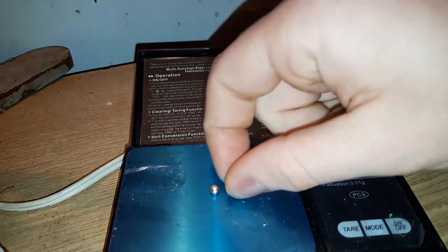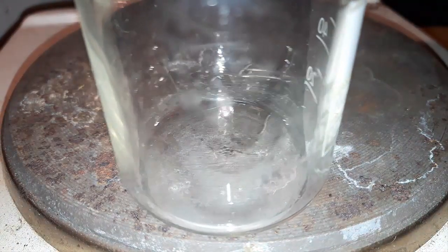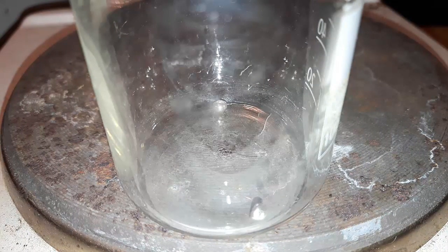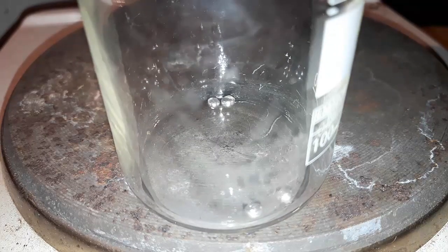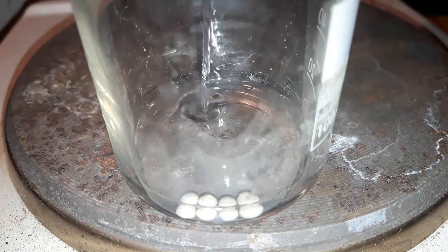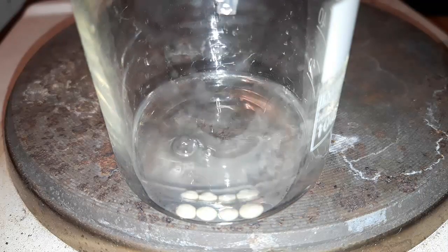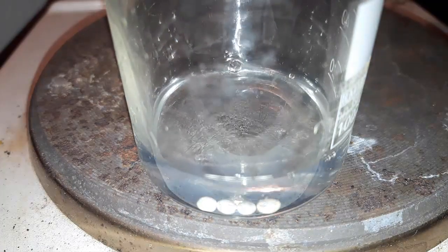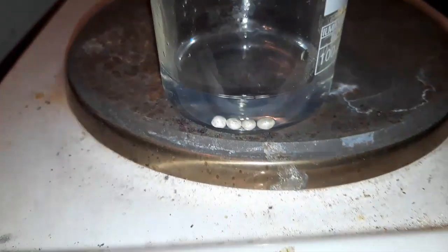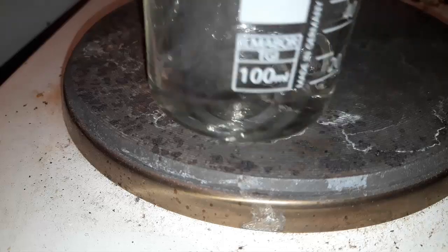For the silver nitrate we'll have to weigh out 1 gram of silver — the smaller the beads the better since they will dissolve faster. We add 6 ml of 58% nitric acid and 5 ml of water, then turn up the heat and stir until the silver dissolves. It took about 4 minutes to get the silver into solution.